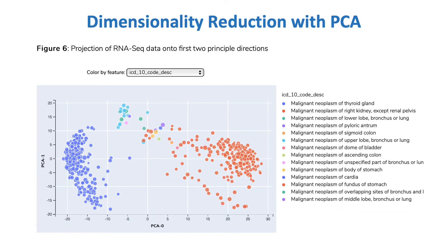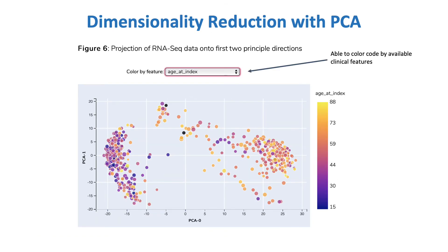Next, the dimensionality of the dataset is reduced through principal component analysis, or PCA. I also generate an interactive scatterplot of the data projected onto the top two principal directions. The color coding of each data point can be set to any of the clinical features, such as ICD-10 code descriptions as shown here, or age of the patients as shown here. Both numerical and categorical features are supported. At this point, you might already be able to observe some clustering in the data.